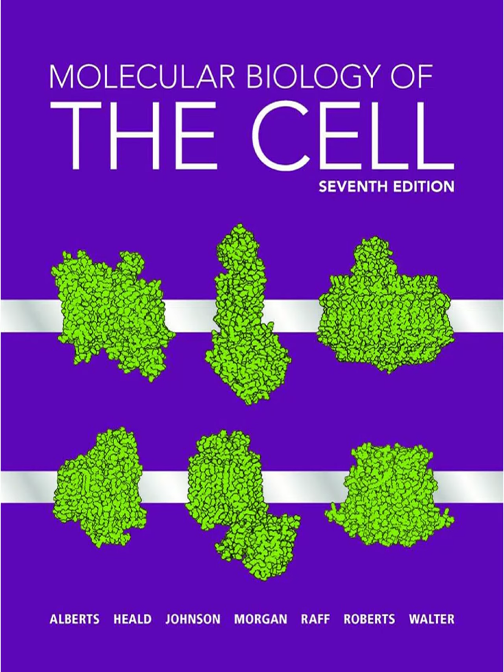It really feels like spying on the cell, especially for tracking those fast, transient signals like calcium ions. That must be tough. It is. Early methods used chemical dyes that change fluorescence when they bound calcium, for instance. But now, genetically encoded biosensors are often the way to go. Based on fluorescent proteins again? Usually, yes. They typically have two parts.